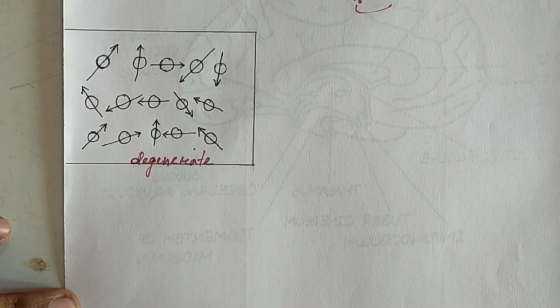Now when a nucleus is not in the field of some external magnetic field, that means there is no influence of any magnetic field or electric field, in the absence of an external magnetic field, a nucleus can orient in a random direction.